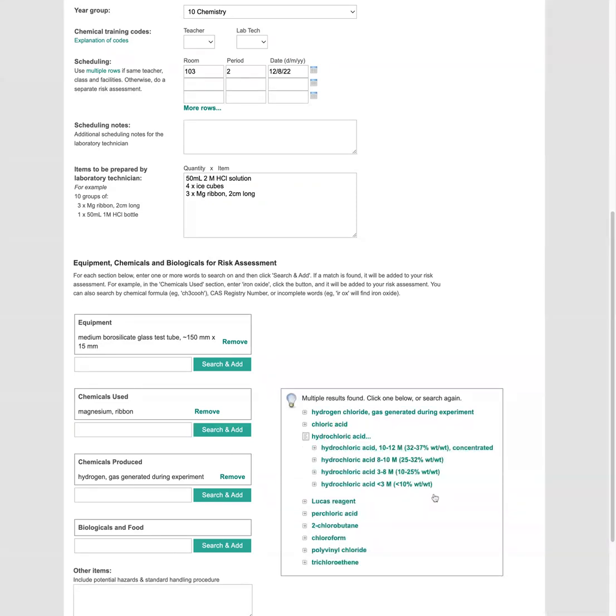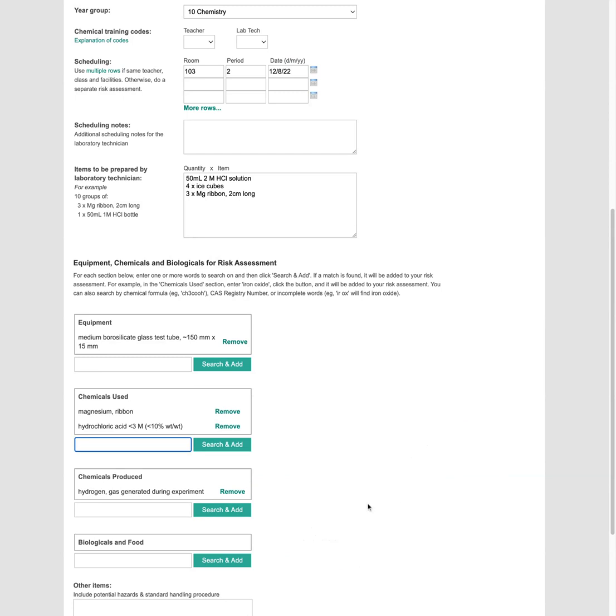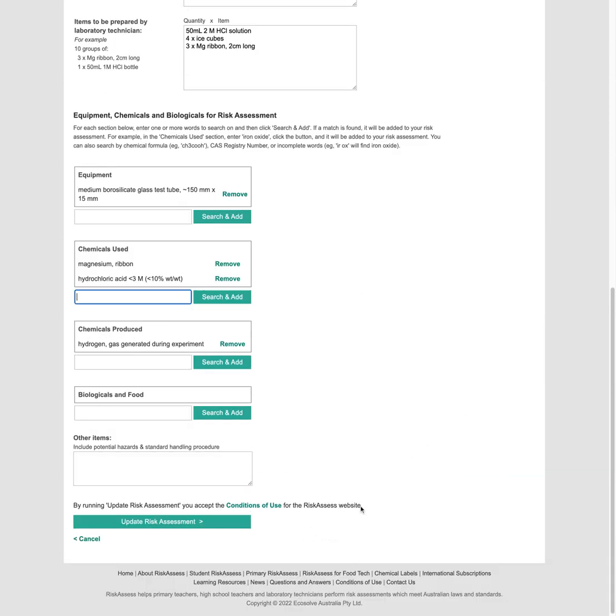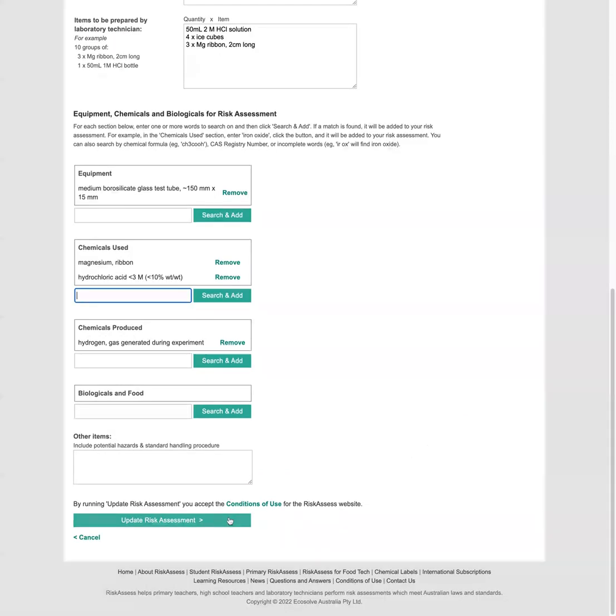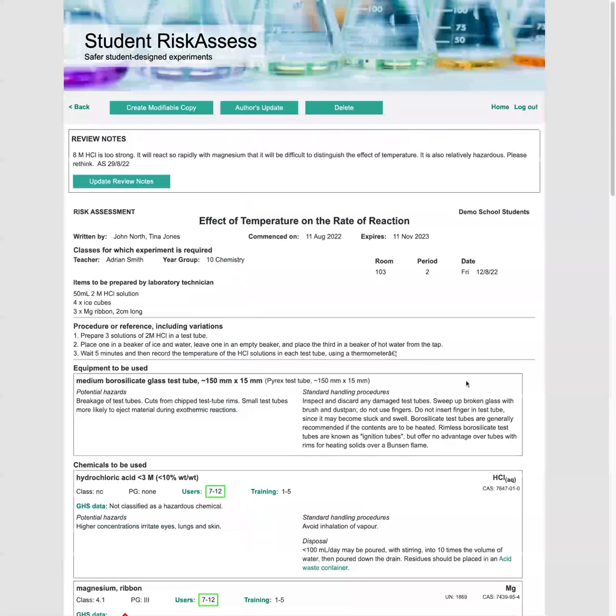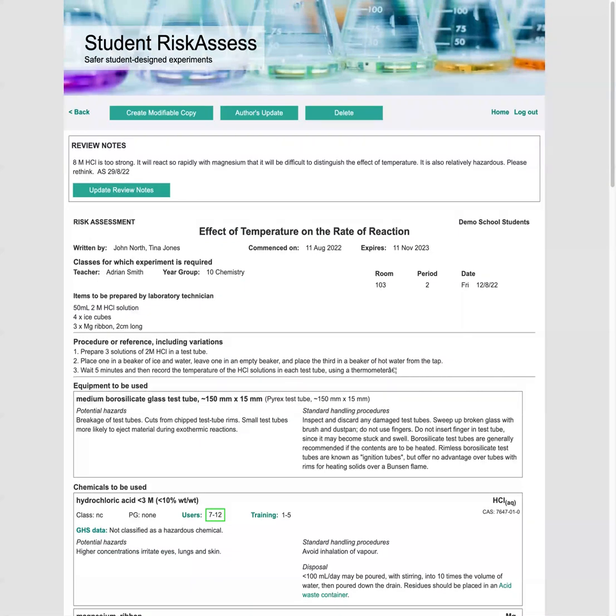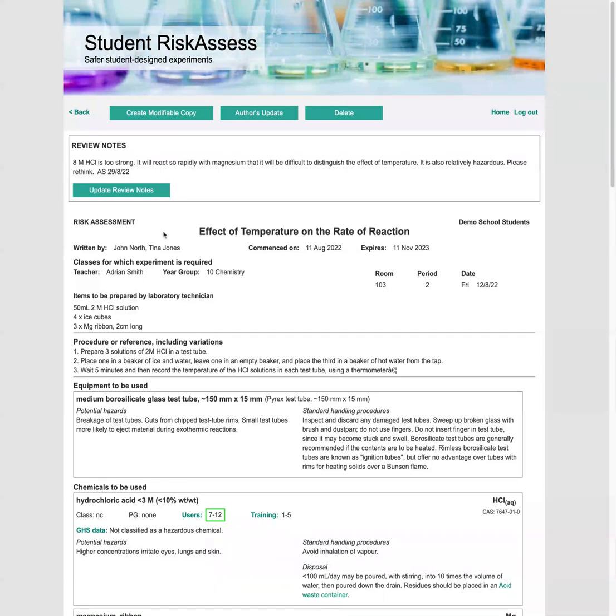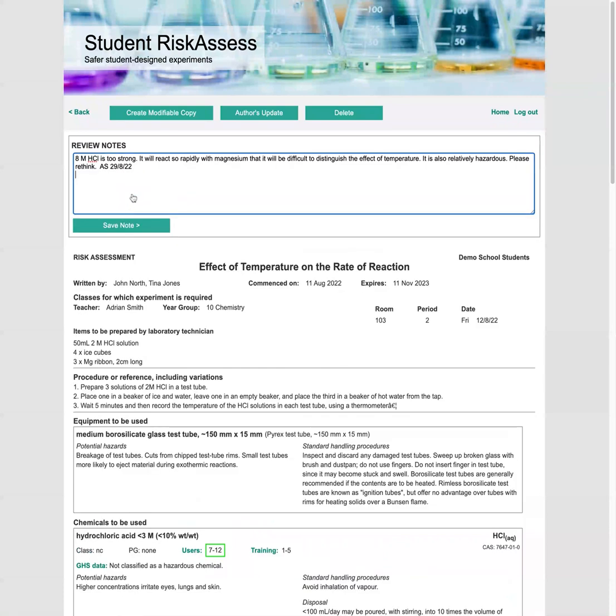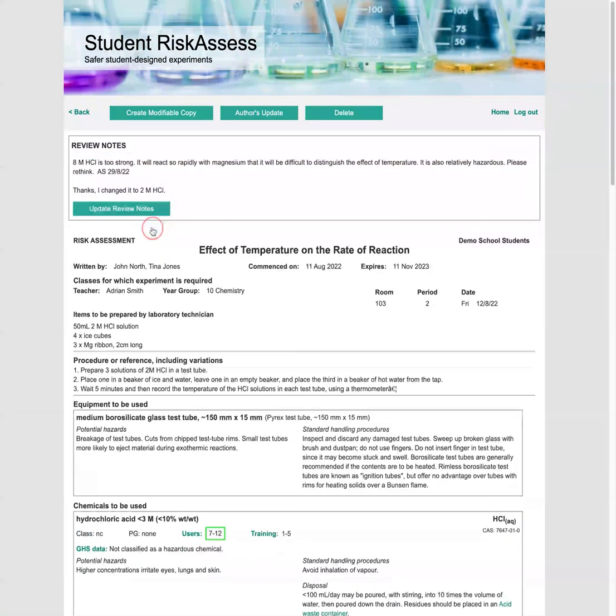So hydrochloric acid, it'd be less than three molar in the ranges. So we go ahead and update the risk assessment. We can also use author's update to make other modifications such as finishing the procedure or changing the items to be prepared. So let's add a note back to the teacher. Yes, we changed it to two molar HCL.